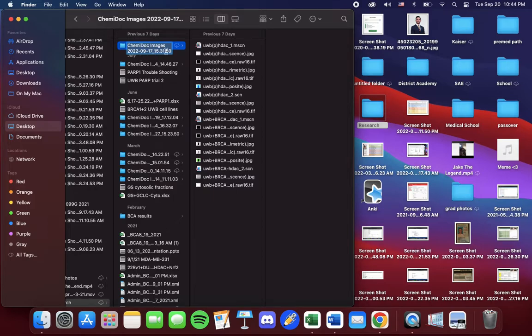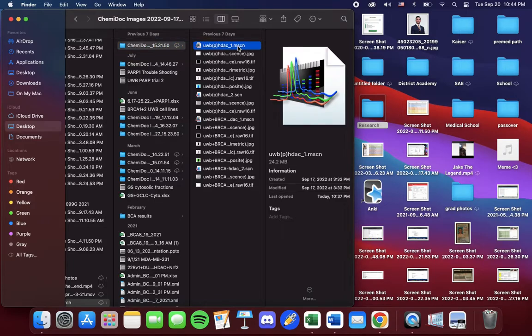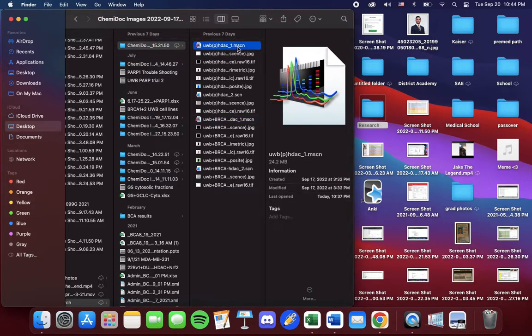Right here this is the file I'll be selecting. Once you've opened up the file you're going to see all these different documents. We want to select the MSCN documents. These will be the MSCN images.